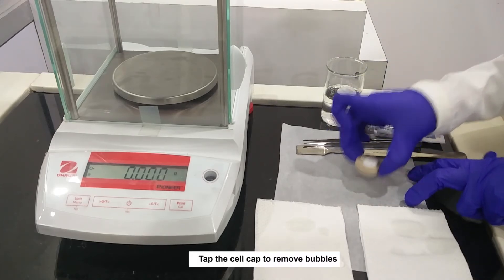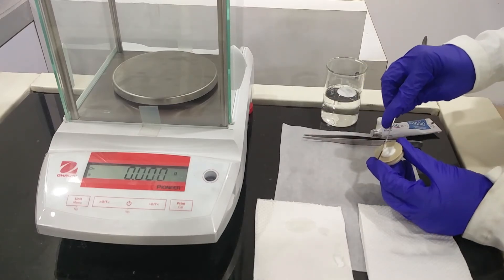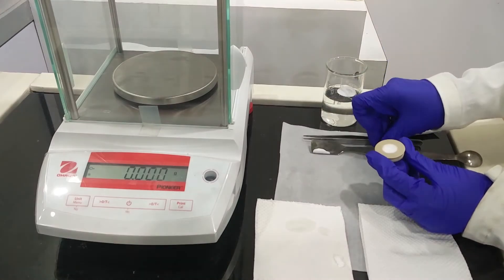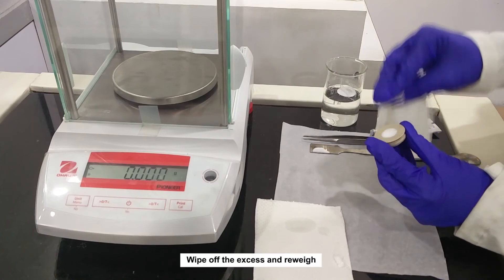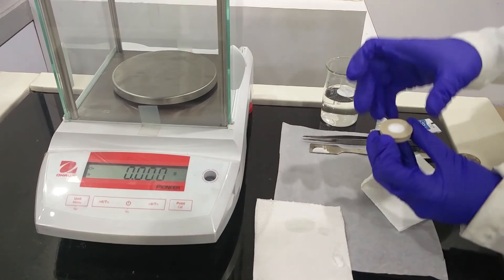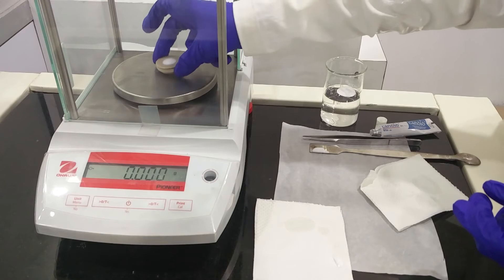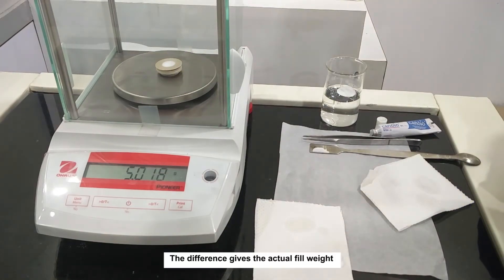Discard a small quantity of formulation first. Tap the cell cap to remove bubbles. Wipe off the excess and re-weigh. The difference gives the actual fill weight.